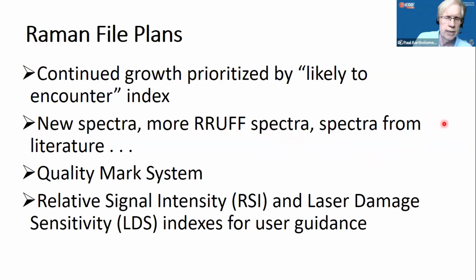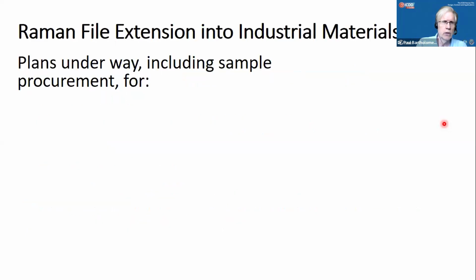I'm also working on a couple more metadata fields, relative signal intensity and laser damage sensitivity, again as indexes for user guidance so they can quickly decide what they're getting into and how they're going to deal with the kinds of samples that are their targets.